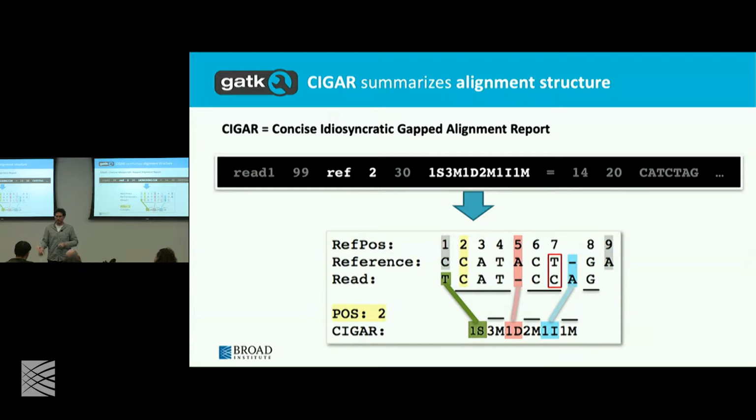Why don't you call it a match? Because then the first statement of the CIGAR string would be 4M. This is a cartoon. I'm not saying that this particular string of bases would get this particular alignment. I don't want to give you an alignment of 120 bases because it will take all day to go through it. But the point is that the ends of the reads can be clipped. This is the moral of the story. It's not about this 1 base being clipped.